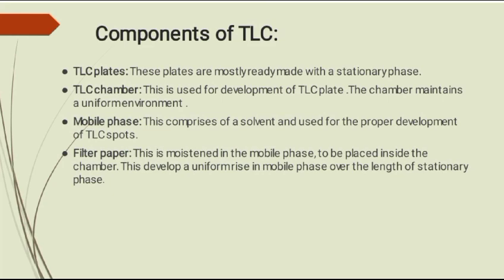TLC plates are ready made. TLC chambers are used for development of TLC plates. Mobile phase is used for the proper development of TLC spots, and filter paper is used for a uniform rise of the mobile phase over the length of the stationary phase.